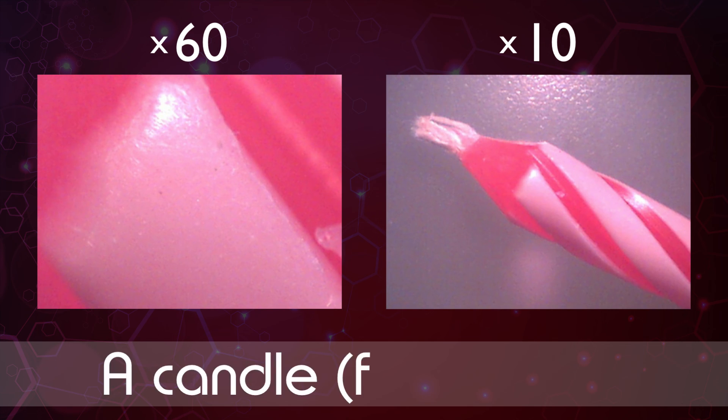And this is our very last object. If you can't think what this is then maybe a clue would help. It's not a food but you would put it on top of food. No prizes for guessing now that our final object is a candle for a cake.